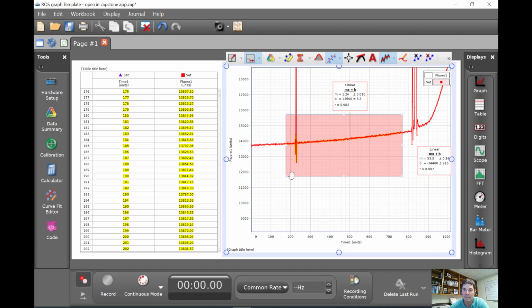Again, if I added this in, then that line might get a little wonky and might not perfectly match up. So what I do is just try to get a line that fits here as we go through. We then have our line, and here's our line of best fit. So we'll go in and type those values.